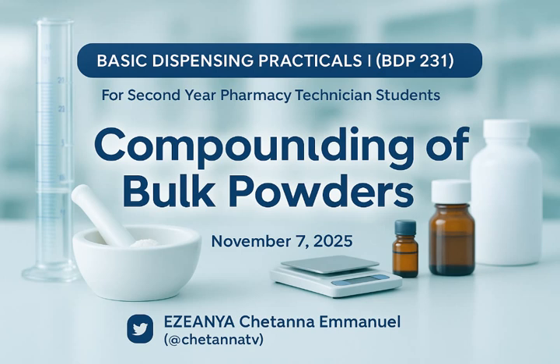Okay, now let's just continue, please. I want you to understand this. But the one I explained so far is clear, right? Yes, sir. So let's go to doubling, how to do geometric what? Dilution.